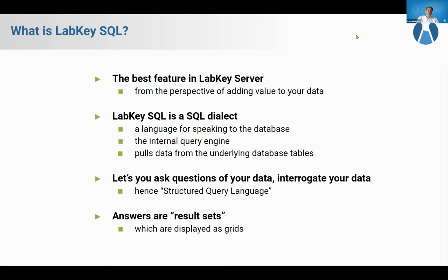Well, I always say this, so I can hear the developers already objecting in the background, but from a perspective of adding value to your data, it's the most important feature in the server. LabKey SQL really is the beating heart of the server. It's what brings data out of the database and puts it in the browser for everyone to see. And it does it in both a structured way and a highly flexible way. It really helps you squeeze the most out of your data, more than anything else, I think.